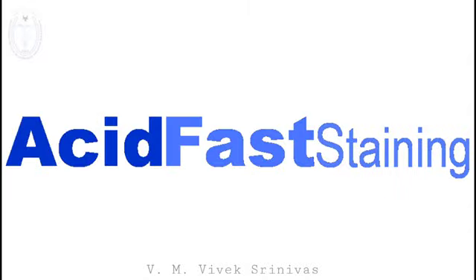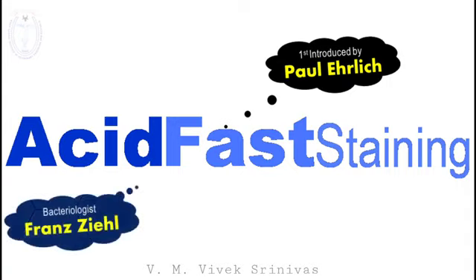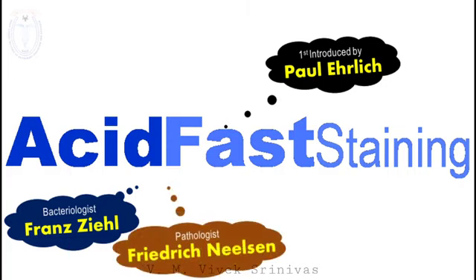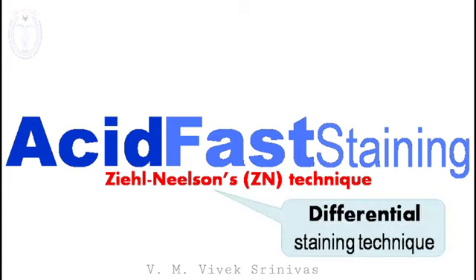The acid-fast staining technique was first introduced by Paul Ehrlich. Later, it was modified by two German doctors, the bacteriologist Franz Ziehl and the pathologist Friedrich Neelsen. So, this method is also popularly known as Ziehl-Neelsen's technique. This is a differential bacterial staining method. Here, more than one stain is used.